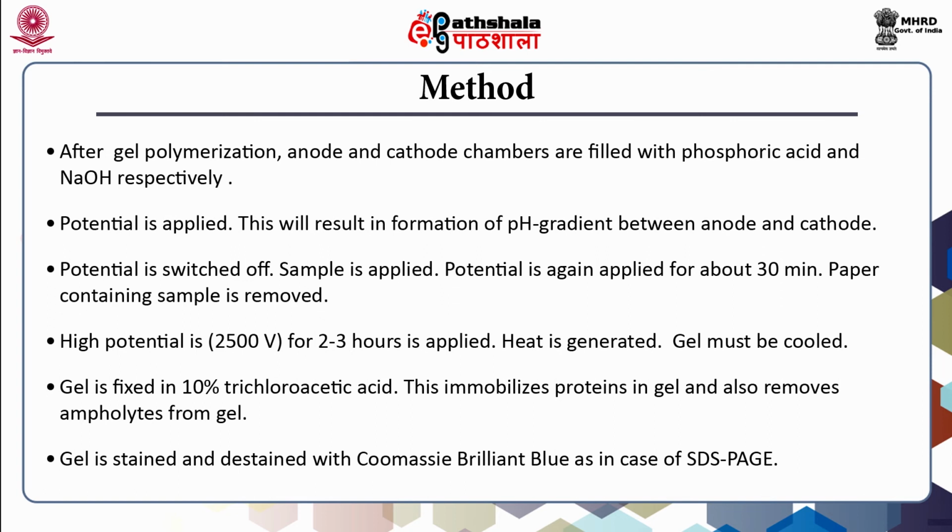Isoelectric focusing can also be used for preparative applications. In a vertical column, add a mixture of Sephadex G-75 as gel matrix, ampholytes and sucrose to create a gradient in the column. Once separation is completed, elute out the sample for further processing.